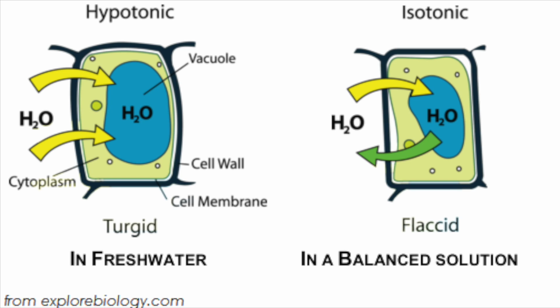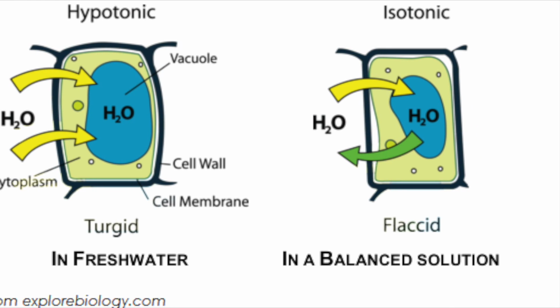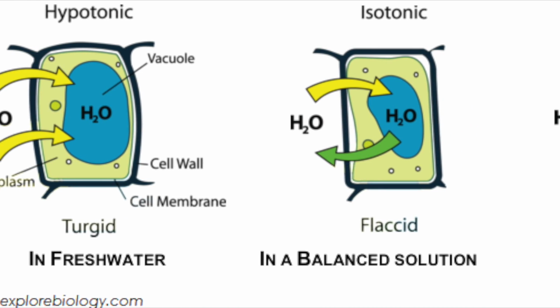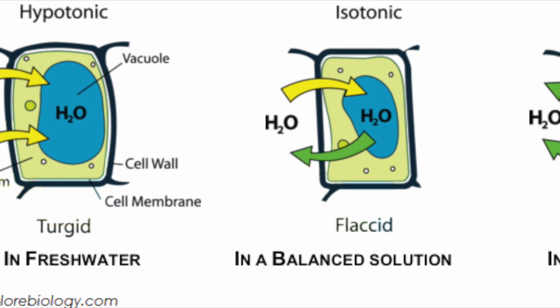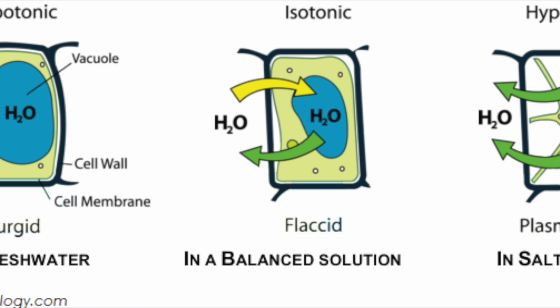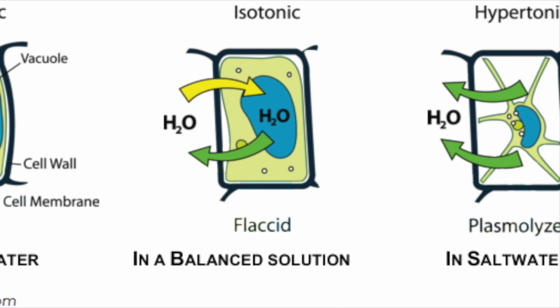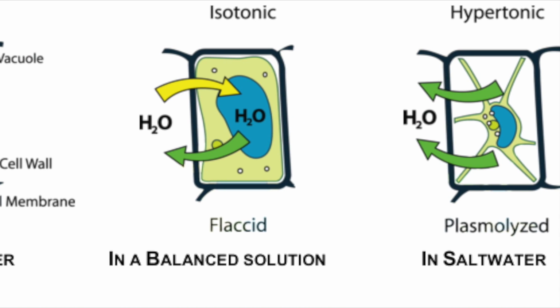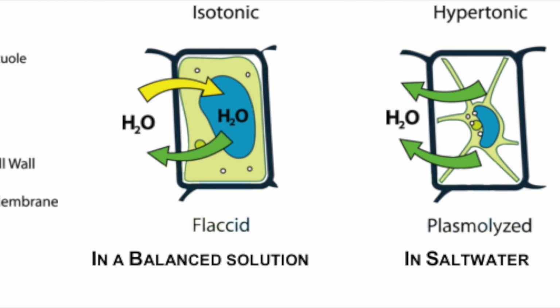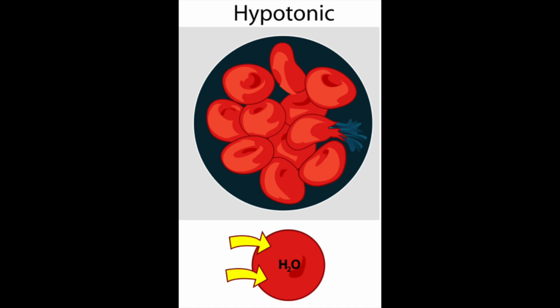In reference to the cell situations, any cell that had lost mass would have begun as hypotonic because the water would have been driven to move outside the cell, from a higher concentration gradient to a lower one. Cells that gained mass would have begun as hypertonic because over time osmosis would have prompted the water to move inside of the cell. All of our solutions would have been considered hypotonic, since all the cells' mass increased.